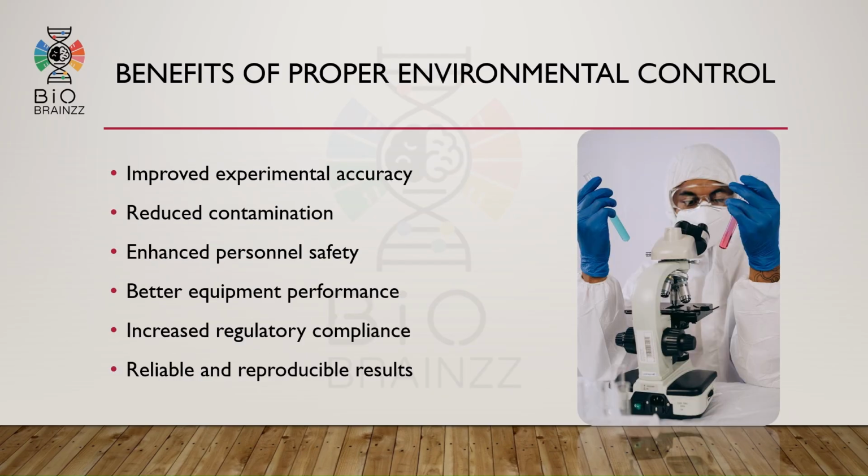Now, let us discuss the benefits of proper environmental control. When laboratories maintain proper conditions, experiments become more accurate, contamination reduces, equipment works better, personnel safety improves, and regulatory compliance becomes easier. Most importantly, laboratories can produce reliable and reproducible results.